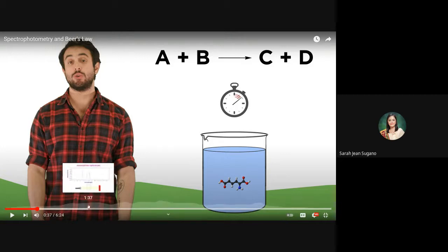Just like ethanol is a liquid form. And also, right, when we want to drink an alcoholic drink, there is a certain percentage of alcohol present, right? 4% alcohol, 5% when we flavored beer. So that is why using this spectrophotometer, you can really determine its concentration using this absorbance.